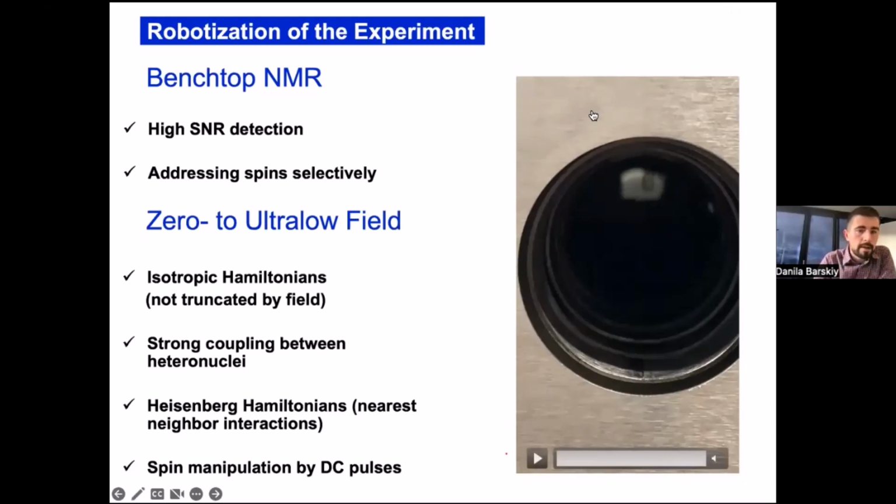So one of the practical problems is evaporation of the solvent, and catalyst deactivation as well. We have this beautiful catalyst which binds both hydrogen and the substrate, but in fact, there is deactivation. We know that over time, even if the solvent stays at a good level, we still see a decrease of the signal with time.